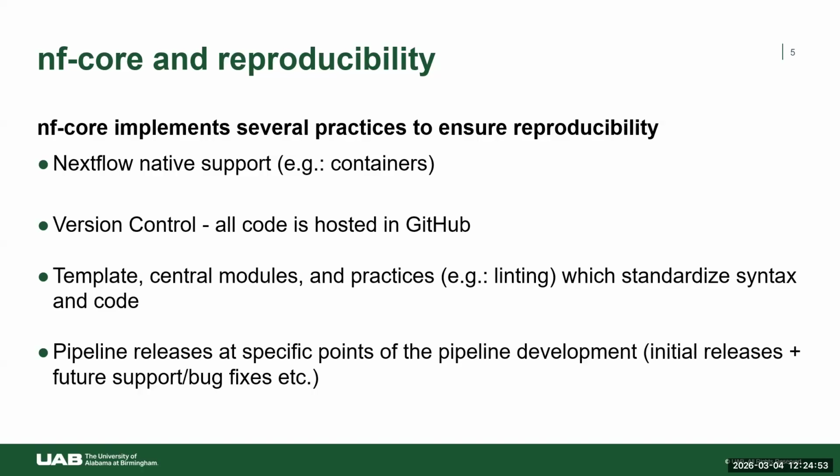Now, that's not always going to be feasible. We actually, in our own workflow, had to create our own modules because not every single module for workflows will exist in NF-Core. But if you do create one, you still need to follow the best practices on how to do it, in the context of applying the syntax rules that are recommended by NF-Core, and so forth. And even when you're done working on your workflow, let's say everything is working, you still want to go ahead and perform linting, right? So linting will ensure that the actual syntax across your workflow is indeed following what they recommend as best practices. And that's just to make code maintenance a little bit easier.